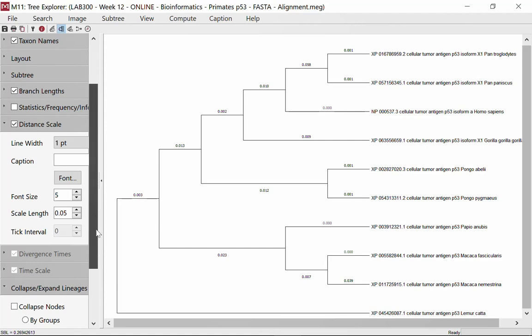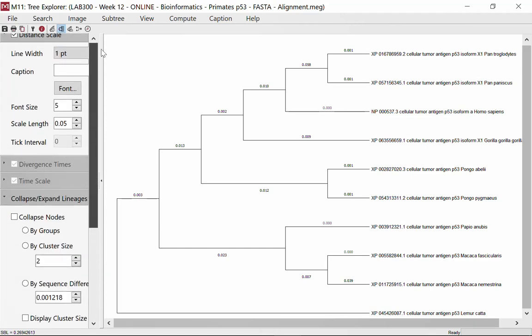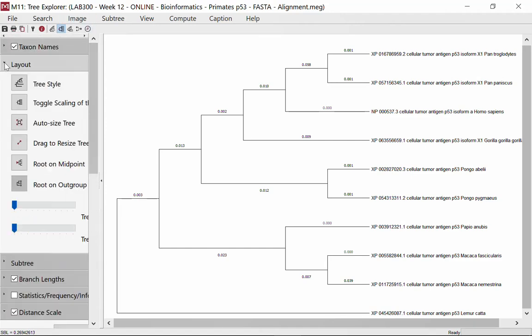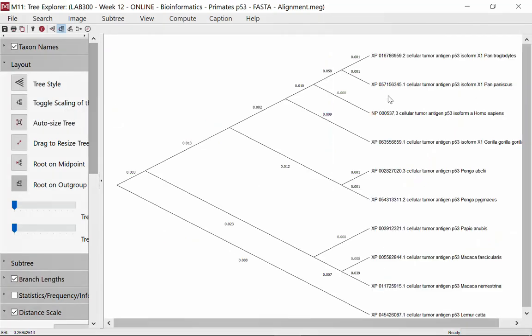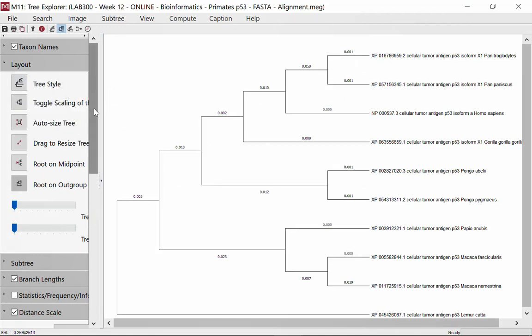You can even generate the trees in different ways if you want, like a circular way. So here you can make them circle, not very helpful to look at what we're saying here, or straight lines, as you might be used to seeing sometimes online. I like it personally even better than the rectangular one, but you can play around and show it in different ways.